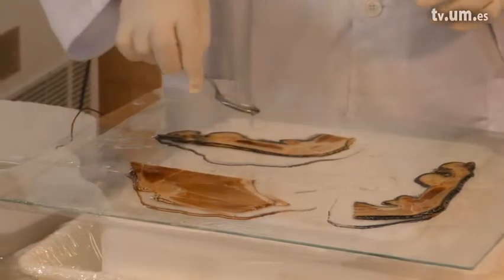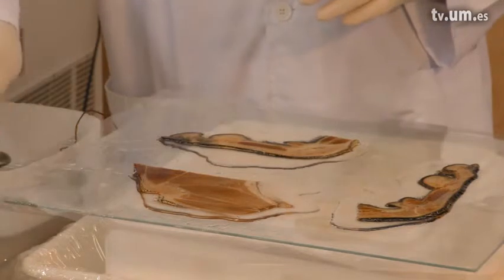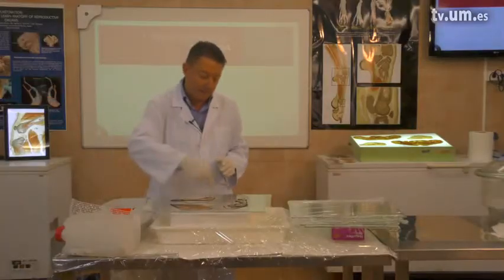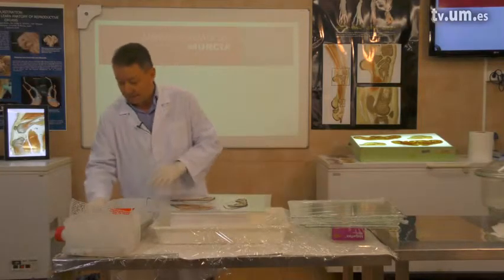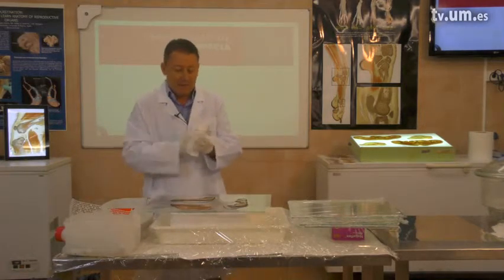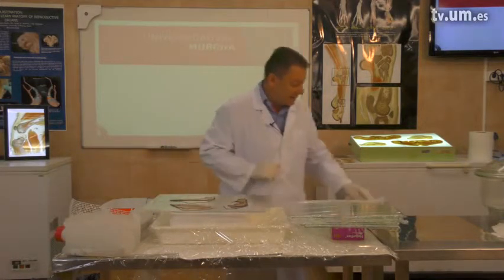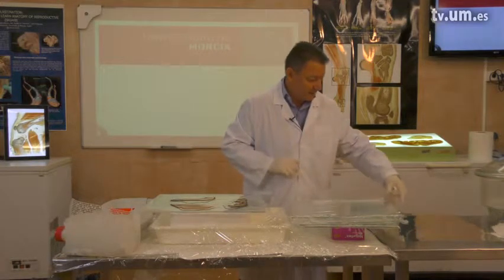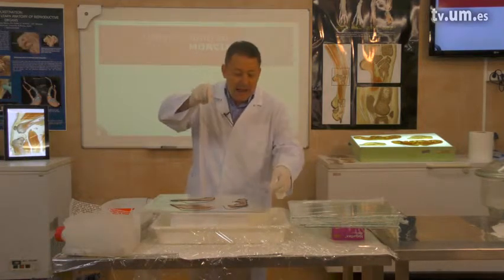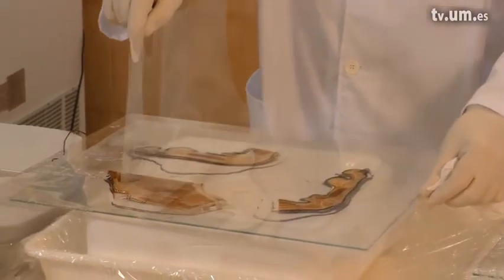We will pour a little bit — not excessive, but a little bit — of resin on each slice that we have placed on our foil. The next step, and you have to have clean hands for that, implies using a covering foil to cover these slices. We will take another foil, 0.2 mm thick, and place it gently over the slices.